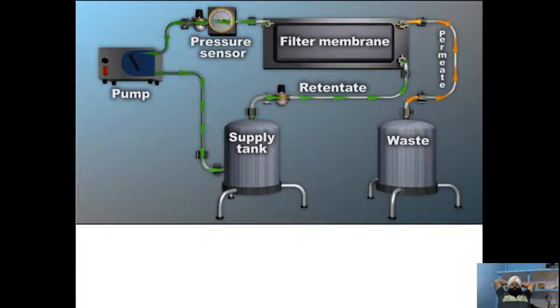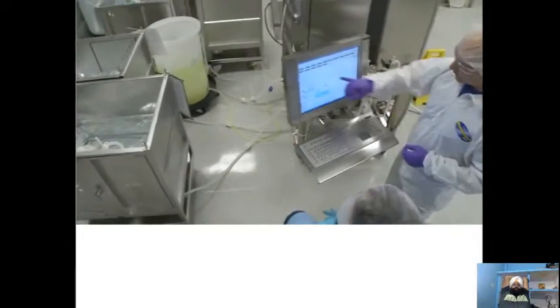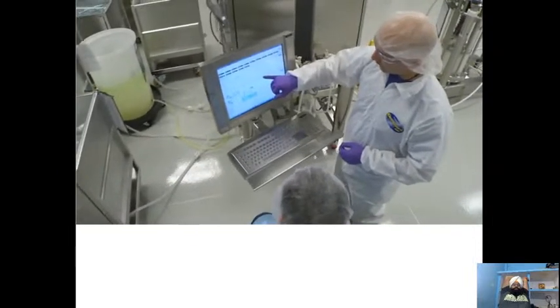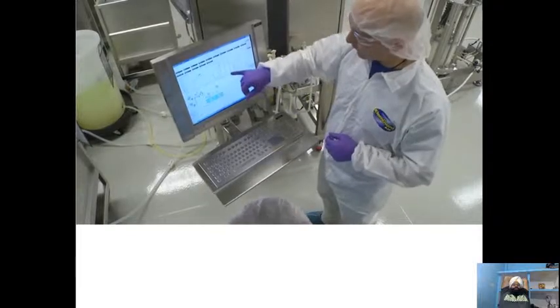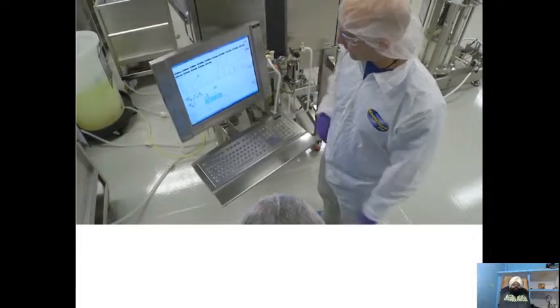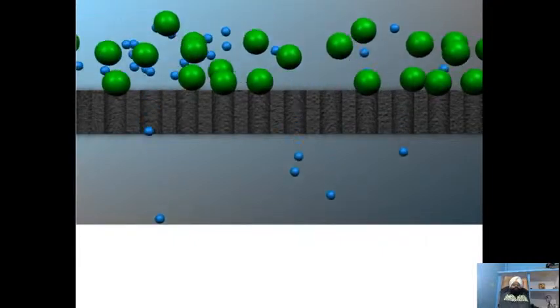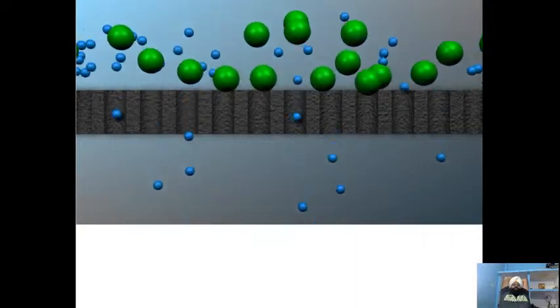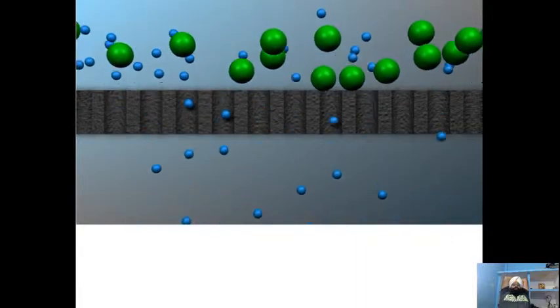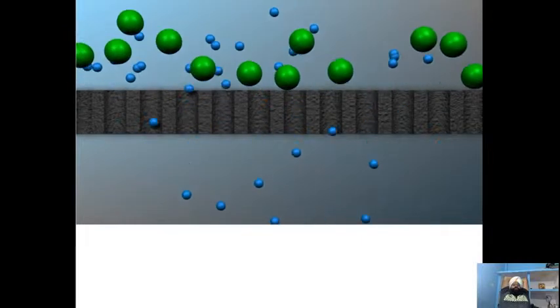Following concentration, and while the protein solution is recirculating, a new solution, a storage buffer, is added to the feed. In effect, the protein is being washed by the flow of a new buffer solution in and the old buffer solution out. As this diafiltration step proceeds, the buffer solution that is being added to the feed replaces the buffer solution that the GFP was originally in, effectively removing any remaining salt as well.